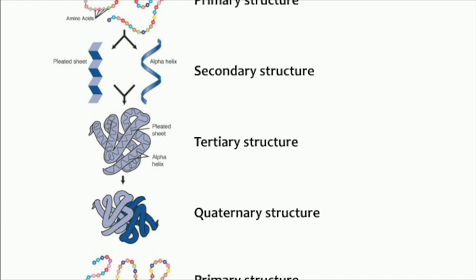So like I said, there are many different purposes for analyzing proteins and many different purposes for the different assays that you use. You can separate them into categories.